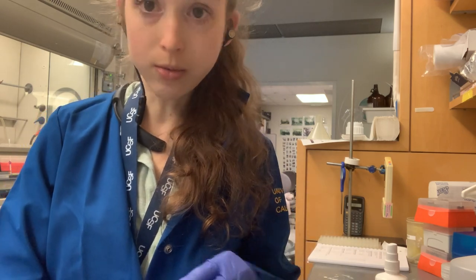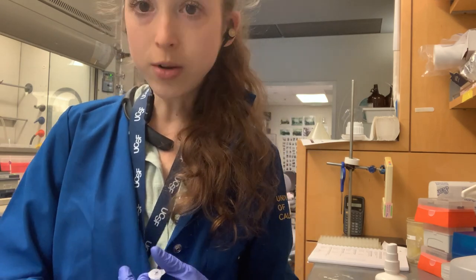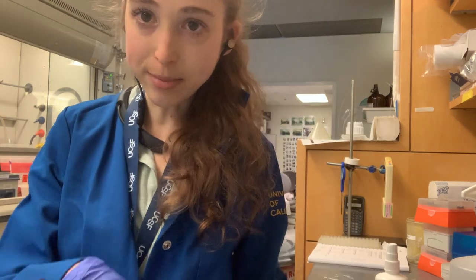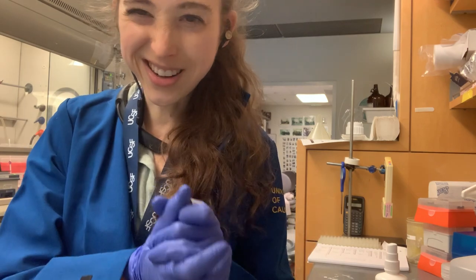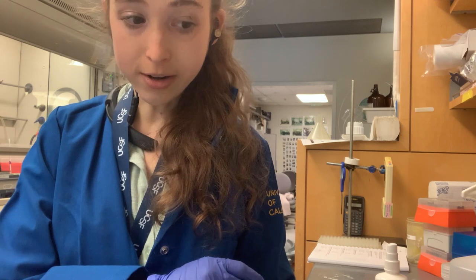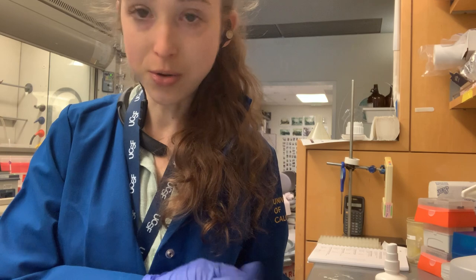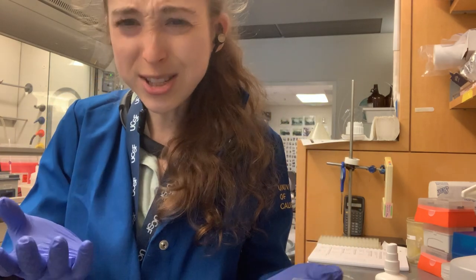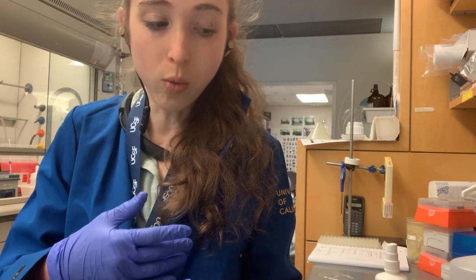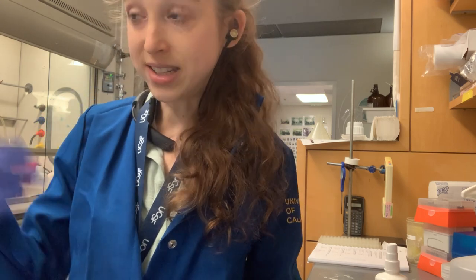Even if it's something you're going to use right away — say you're doing a protein gel and you have 10 tubes labeled 1 through 10 — what if you want to save those for later and rerun the sample? Or what if you run multiple gels that same day and you have three sets of things labeled 1 to 10? At least use a different color or something to distinguish what experiment it was.